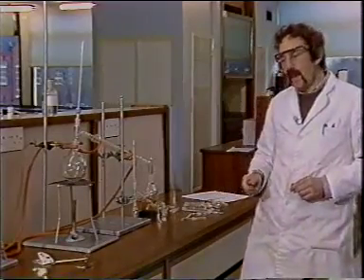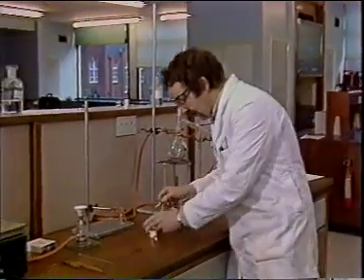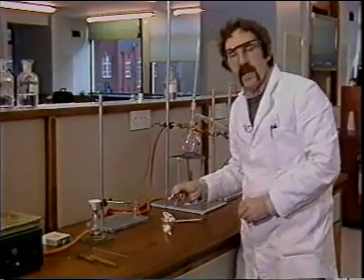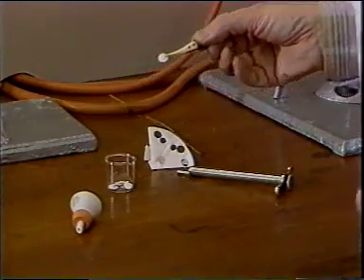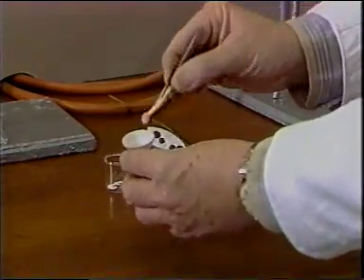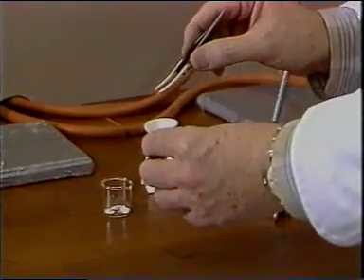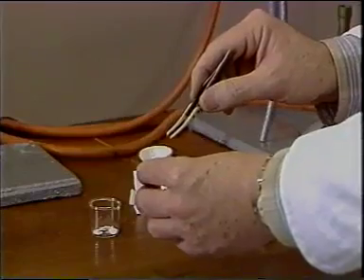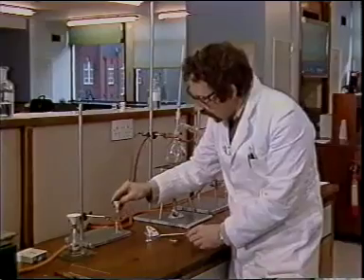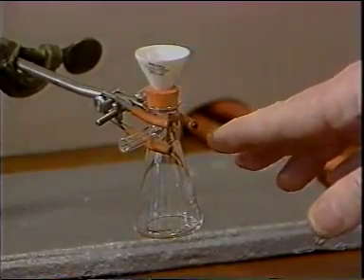When it comes to recrystallization, again, we can do things on a small scale. The 5mm filter paper, cut with a cork borer from a pad of filter papers, placed in a Hirsch funnel, will hold up a lot less of a recrystallizing solution than a fluted filter paper. It can be filtered under slight suction in this miniature Buchner apparatus.